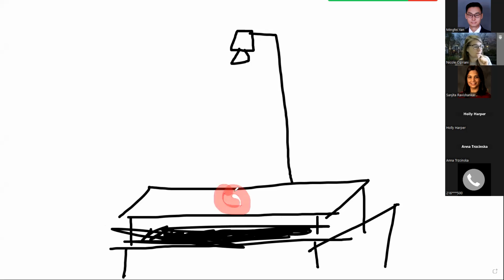Okay, so the way that the lighting was set up was that because you had this really dark velvet background and the specimen was elevated from the background on glass, the velvet background would actually take over whatever small defects were on the glass. And so there were no shadows and no background.